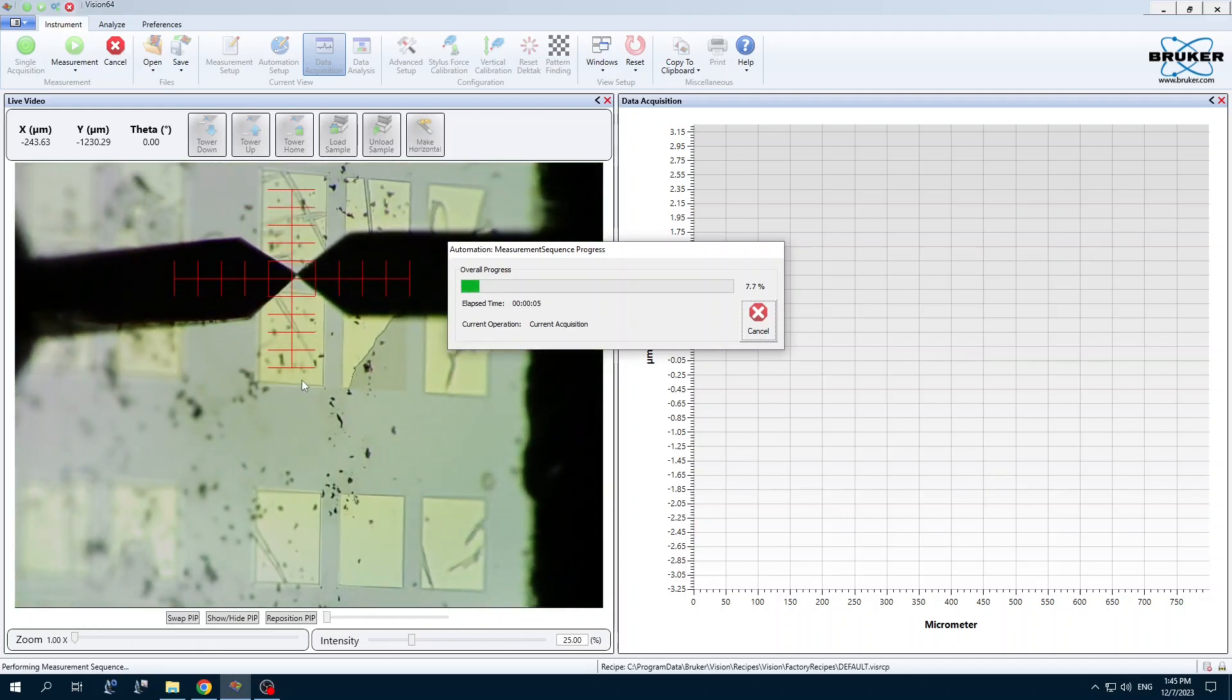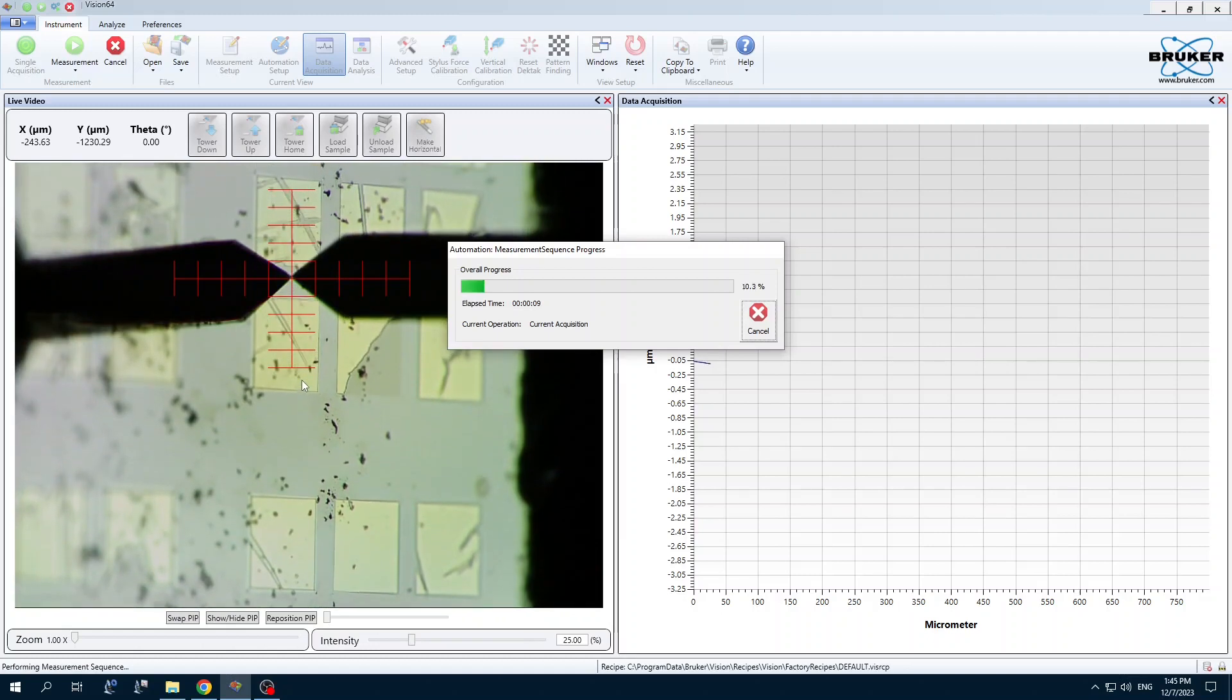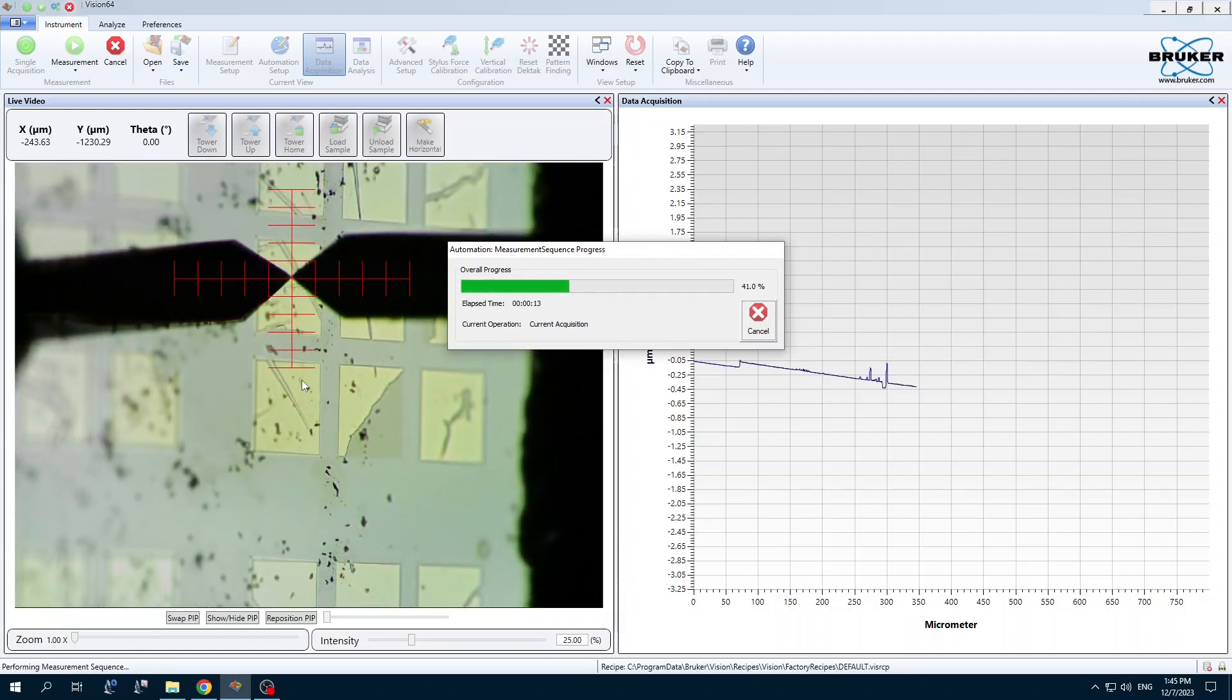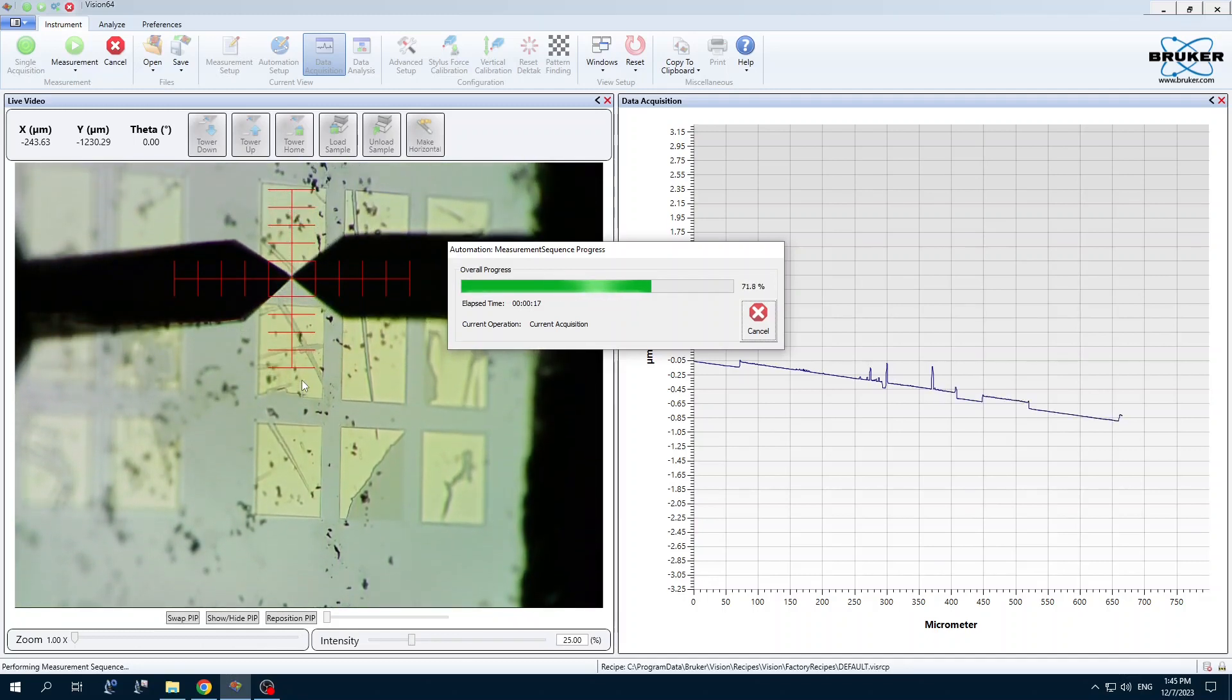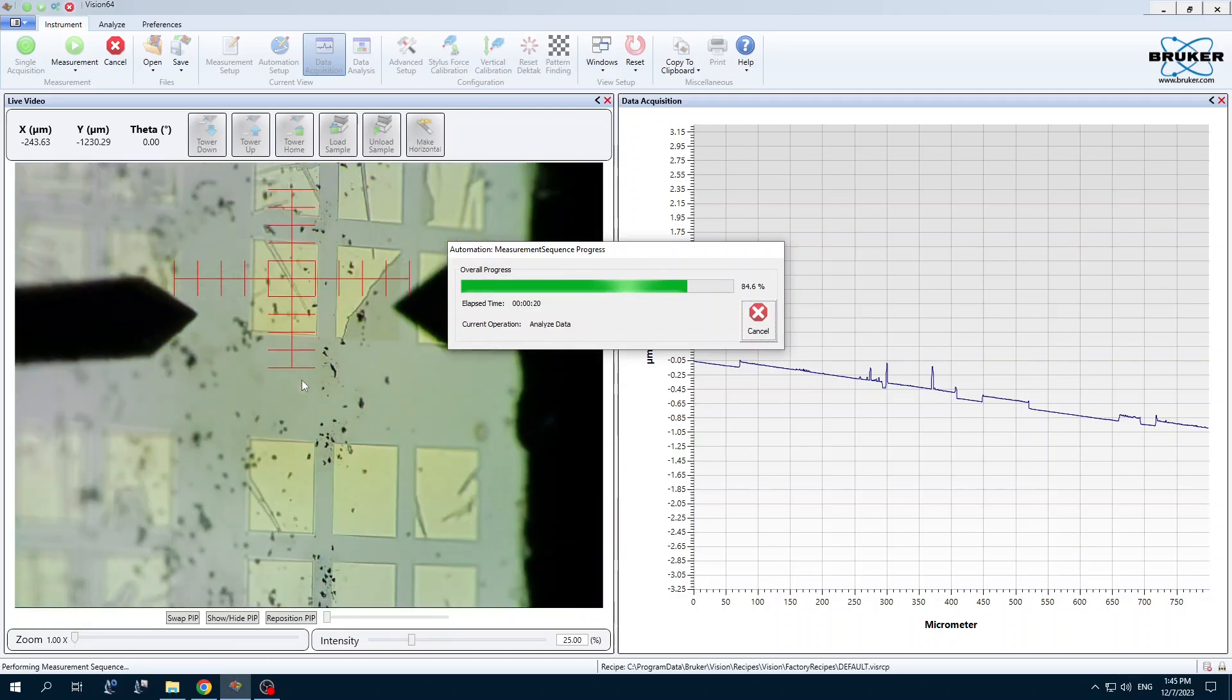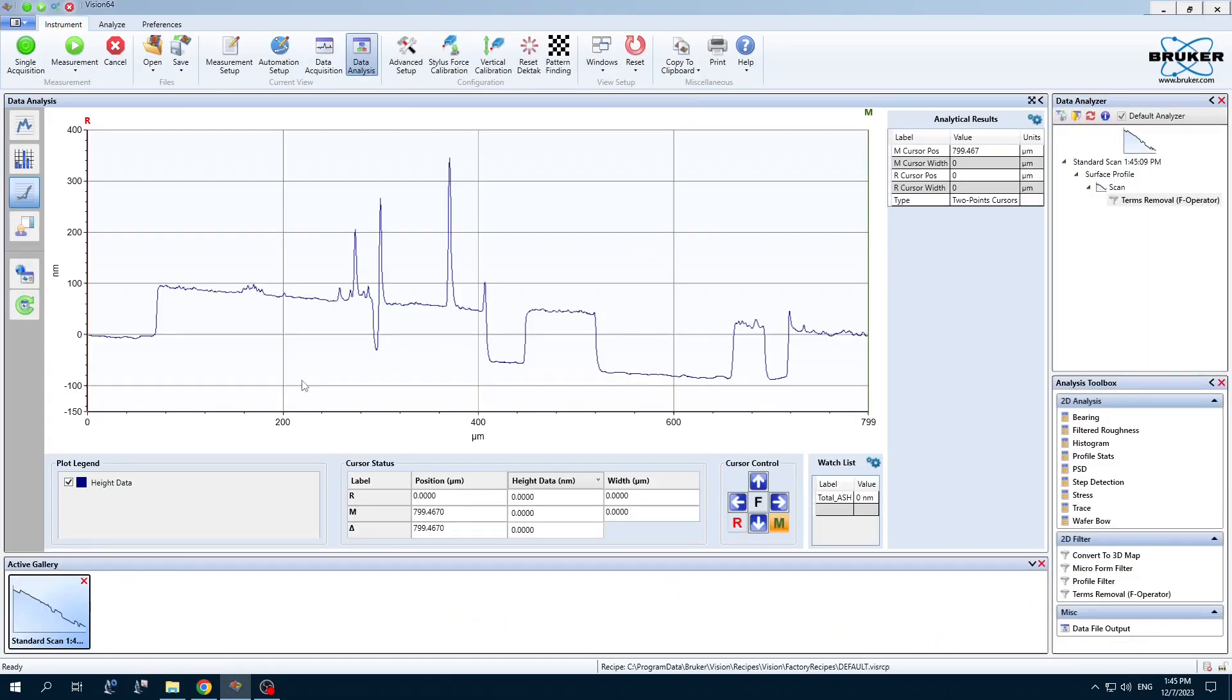Okay. Measurement is complete. Now we can do some analysis.